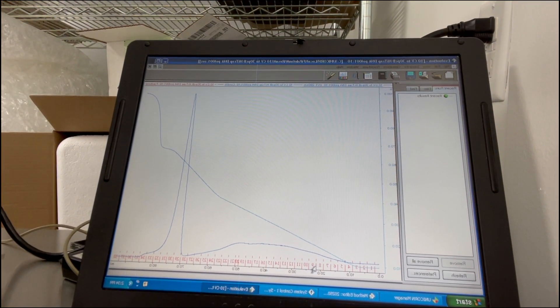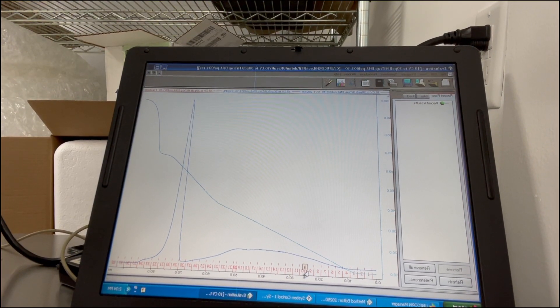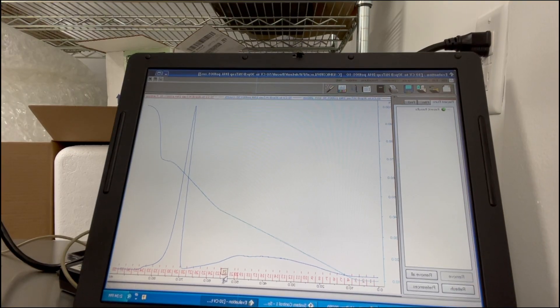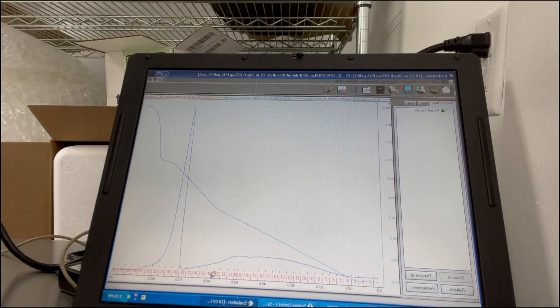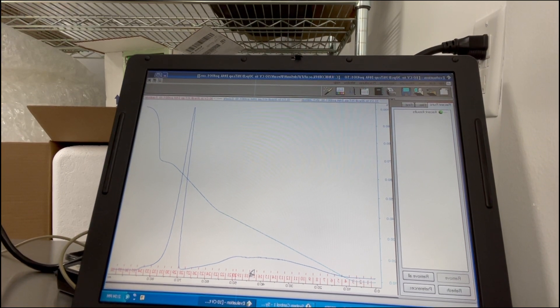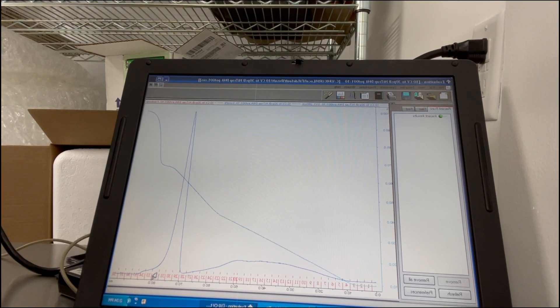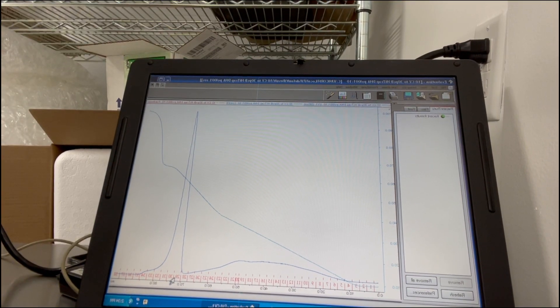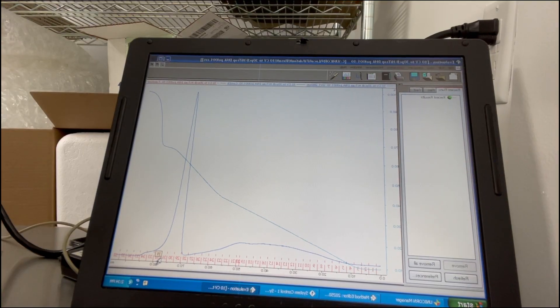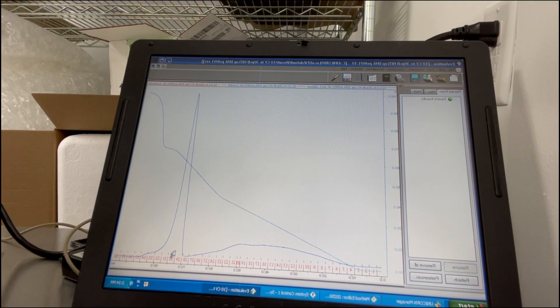And you can see that the UV absorbance starts going up around fraction 9 and it stays high until about fraction 21 when it goes back down. There's something eluting from the column during that time. And there's something else eluting from the column at fractions 29 to 31. It makes a really tall peak. And I know from experience that this is a DNA peak.